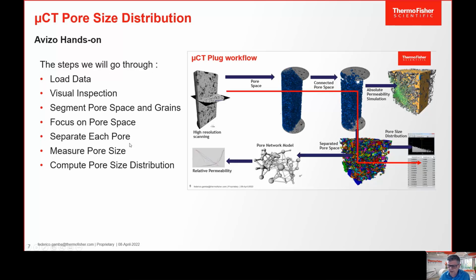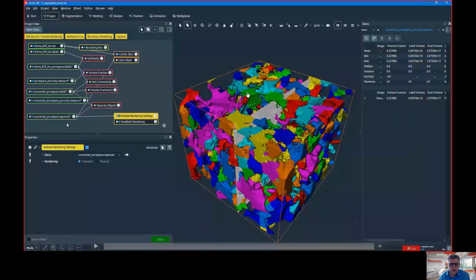We have about half an hour to reach that. Alejandra will guide me if I'm too slow or too fast. I prepared a video of about 16 minutes, but with breaks I will stop it, so we will probably need 20-25 minutes. I hope everybody who wants to do the hands-on has the license and the product installed, so we can start.